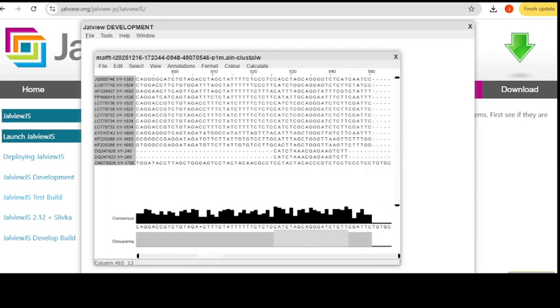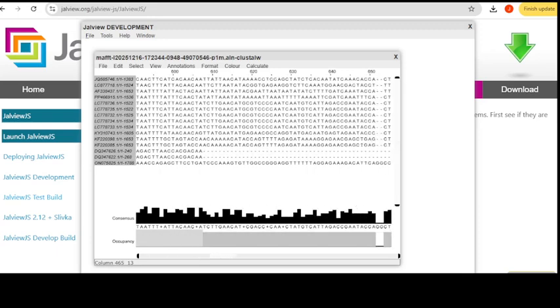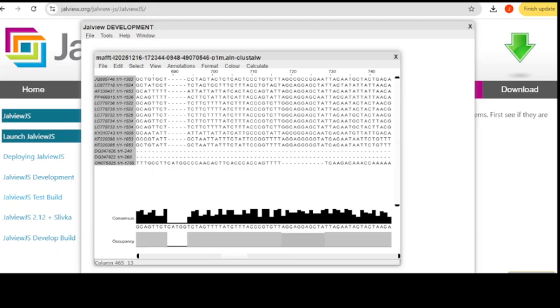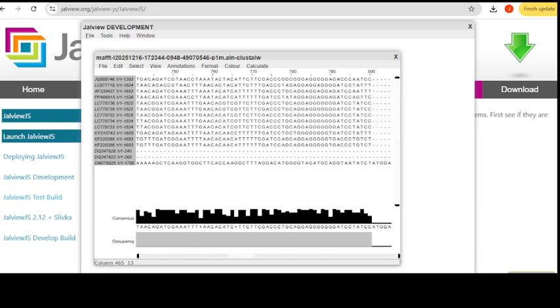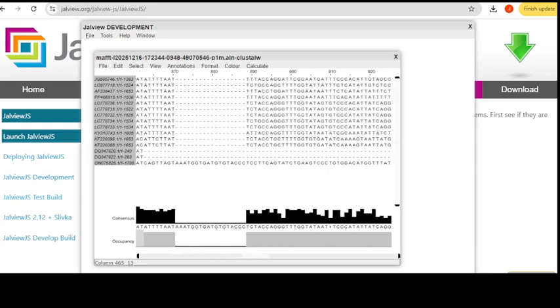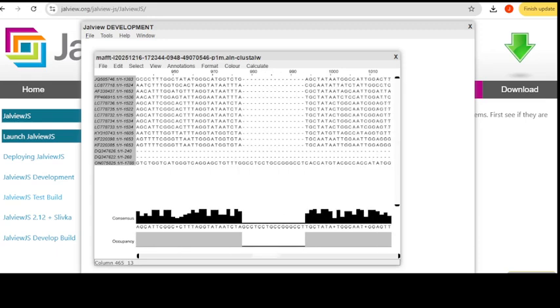and it keeps going. Some reads will end and new will start. So I believe there are 20 reads here, but not all in one place. So that's why the names are being missed, and when you're counting downward, you don't see all of those reads.